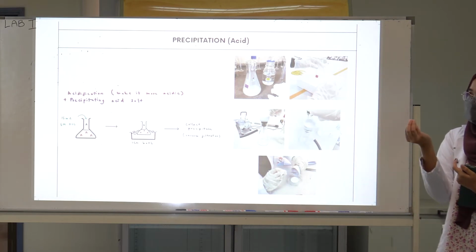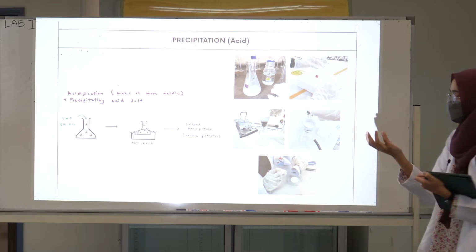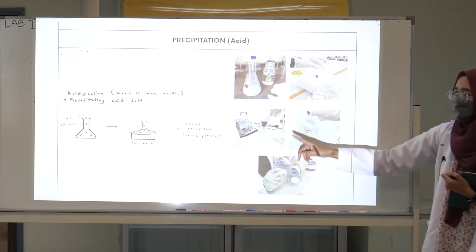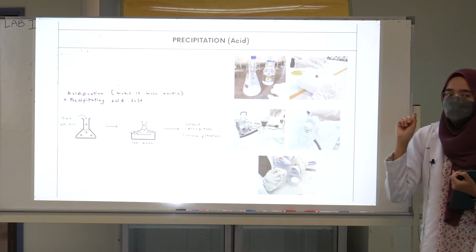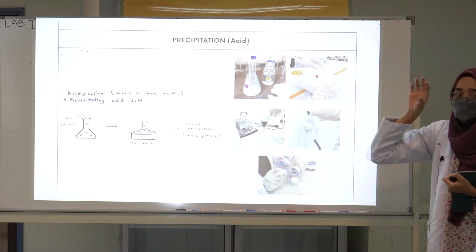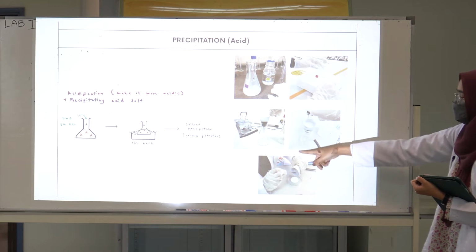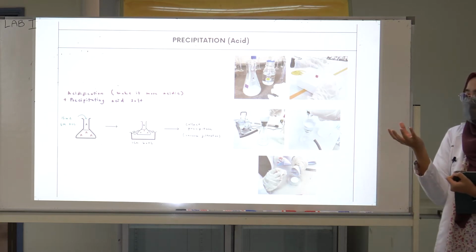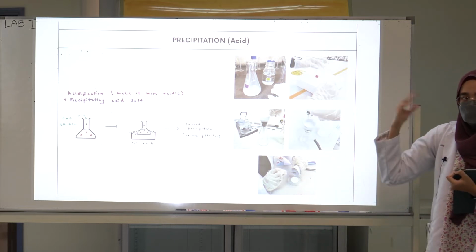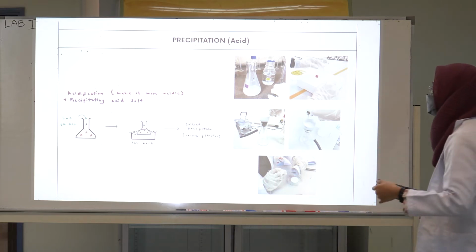Once you already see the precipitates coming out from your aqueous solution, you're going to start this procedure directly. And then first you have to put water into this place here, and after that, you're going to put your acid flask contents inside the Buchner funnel and let it do the vacuum filtration. And right after that, you already got your precipitate on the filter paper. You're going to let it dry for the next procedure, which is the recrystallization. Okay, next.